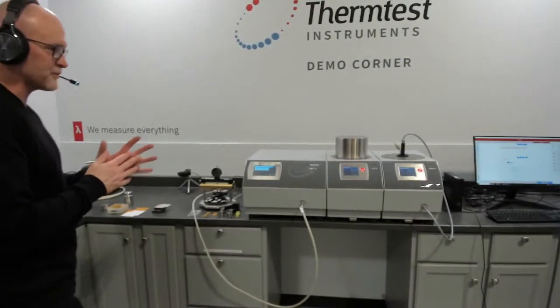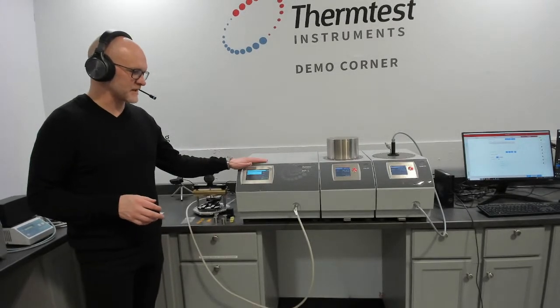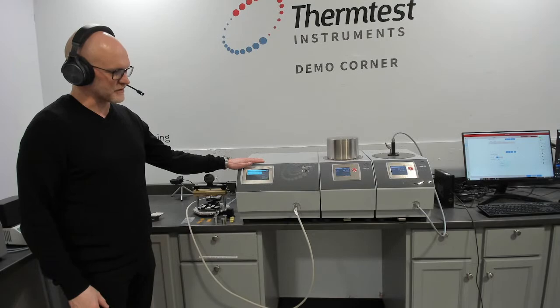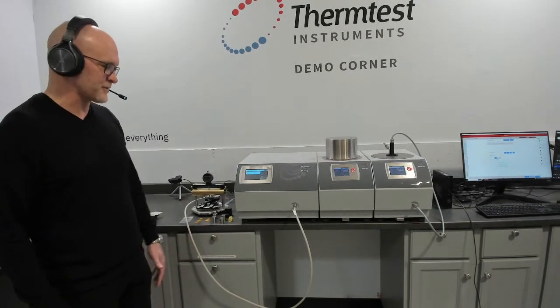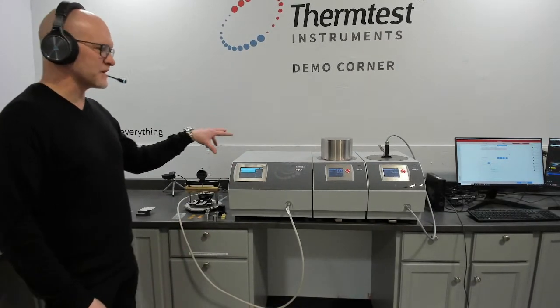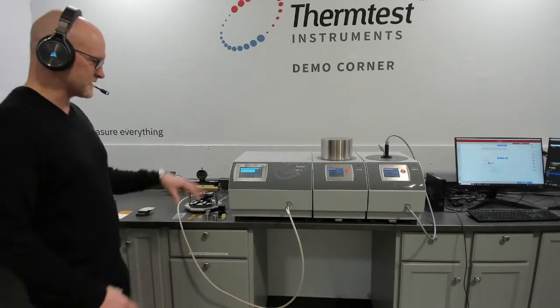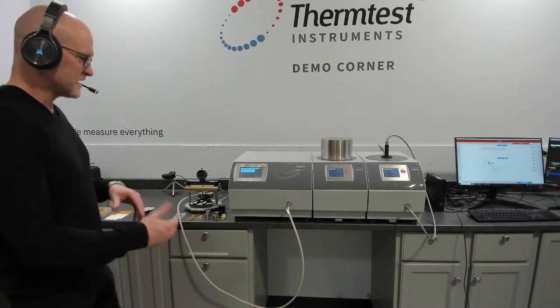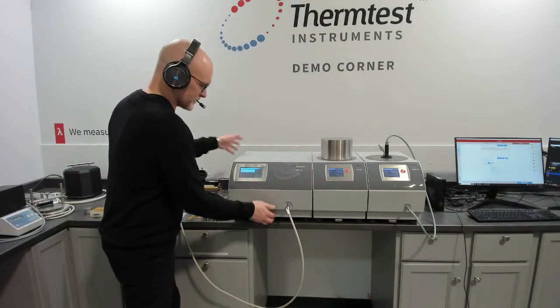So the MP1 before we jump into thin films. The MP1 is our marquee transient method for measuring thermal physical properties, all related properties. It is a measurement platform system. So it's built for scalability and future proofing your needs.